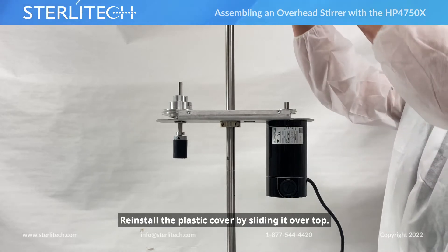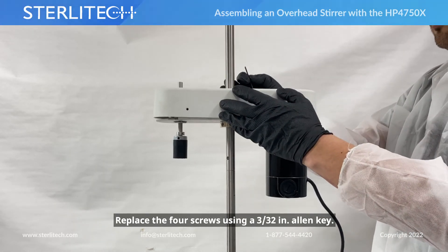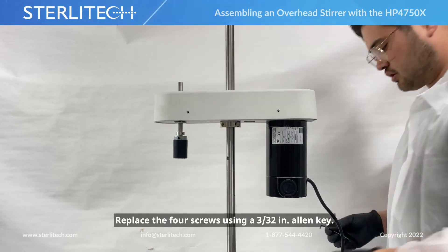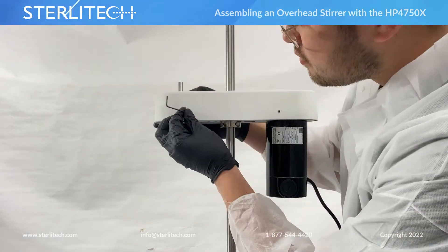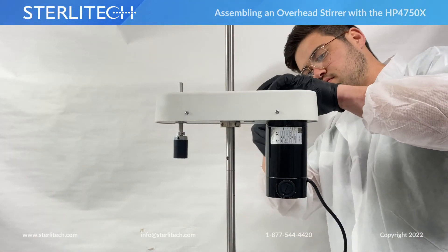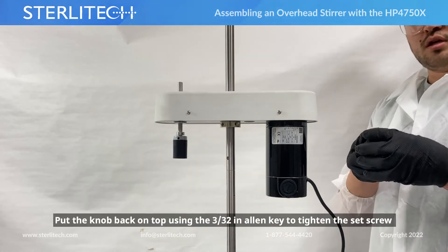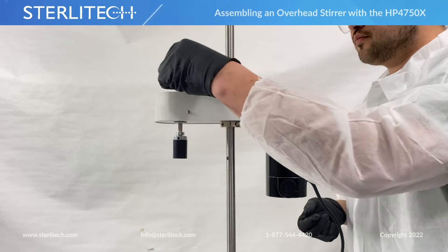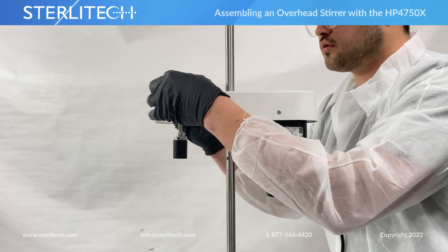We'll reinstall our plastic cover and slide it over. We've got four screws that we'll put back in place using a 3/32" allen key. And then the knob goes right back on top — using the same 3/32" allen key, we'll tighten that set screw.